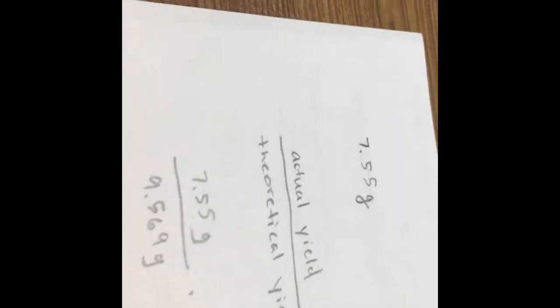It's pretty impossible for it to be 100%, but some factors were that while the alum was being gravity filtered, obviously not everything goes through the filter paper, as the filter paper emerges wet. Okay, so some grams of alum could be lost when we were gravity filtering it into the glass vials. More could be lost when transferring from the beaker to the vacuum filter apparatus. Presence of impurities in the aluminum foil could result in an experiment yield that's not exactly 100%.